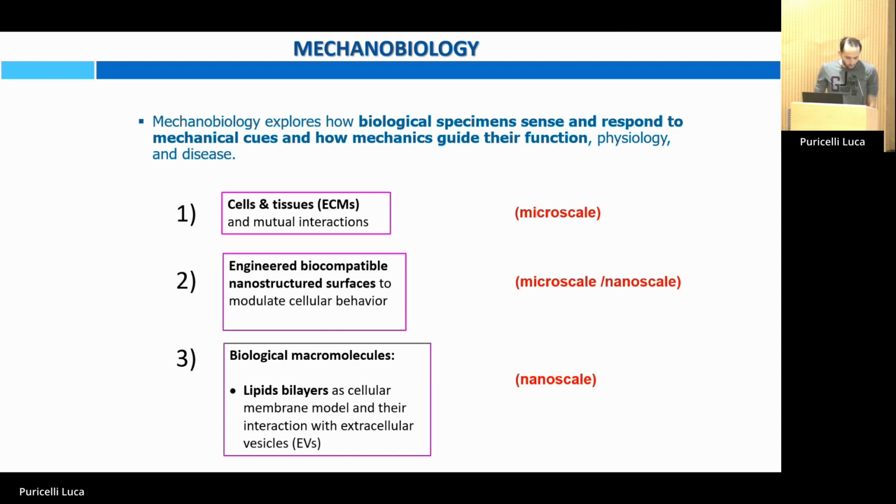To end with, the topic of most interest for this project, which is the model of cellular membranes and their interaction with extracellular vesicles, and this will be focused, of course, on the nanoscale since it is definitely a nanosystem.